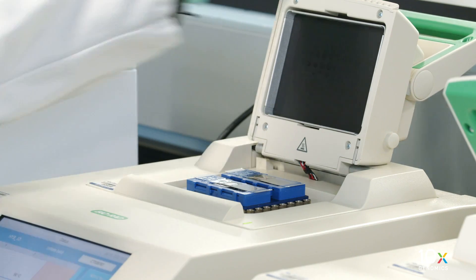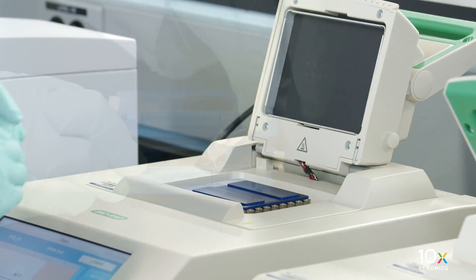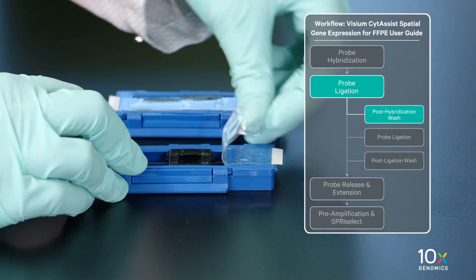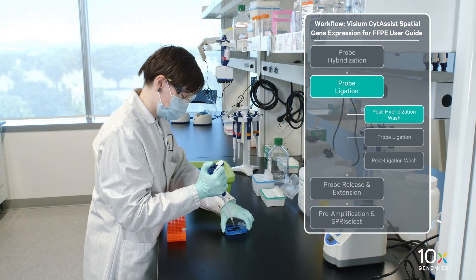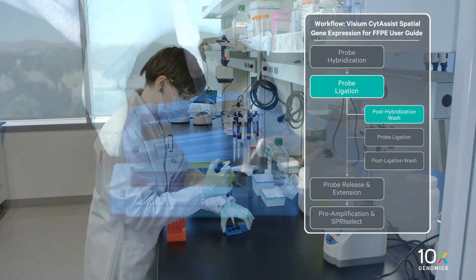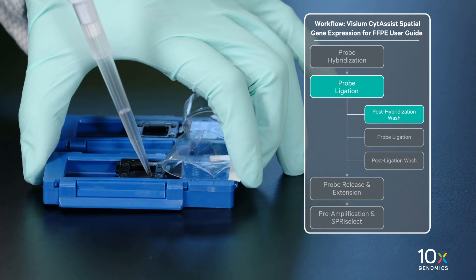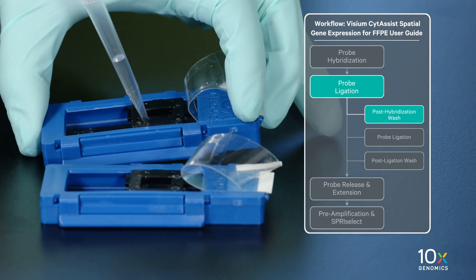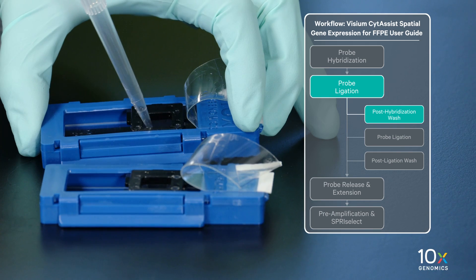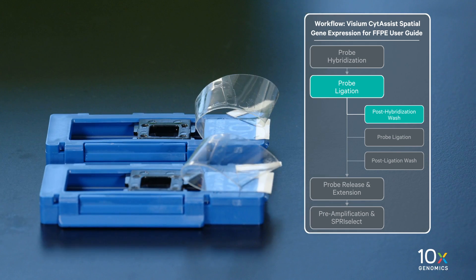Remove the tissue slide cassette from the low profile thermocycler adapter and place on a flat, clean work surface. Peel back the Visium slide seal. Using a pipette, remove all probe hybridization mix from the wells. Immediately add 300 µL preheated FFPE post-hype wash buffer to each well. Avoid well drying or cooling to room temperature. Removal and addition of buffers should be done quickly.